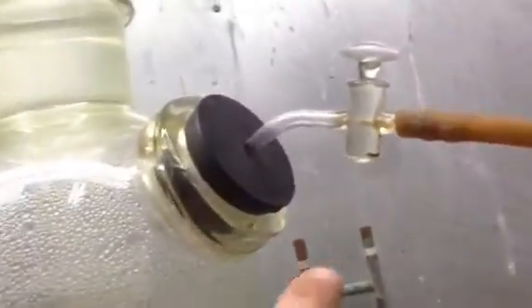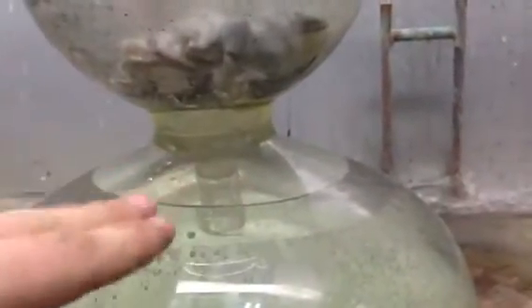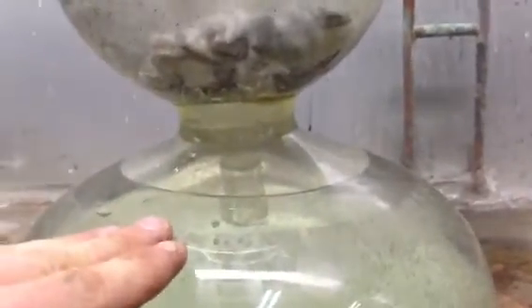Basically right now the valve is closed, so there's pressure built up which keeps the acid away from the reactant, or your medium. When you open this valve here, the pressure is released.